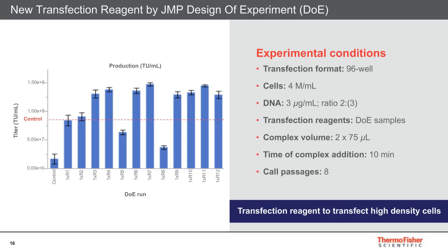Now, so: cells, supplement to slow the cells, but also transfection is very important. And in the past, in my group, we've been developing transfection reagents. We try to develop transfection reagents that work on many different cell lines with many payloads, kind of broad spectrum reagents. In this case, though, we can be a little bit more specific because we go specifically after one cell line. We can control the conditions better, and we know we need to transfect plasmid.